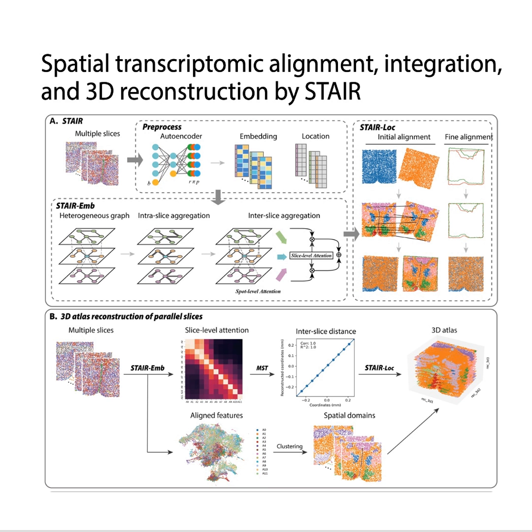And finally, there's the problem that plagues all of these kinds of reconstruction methods. The banana slicing problem. It's a great visual, isn't it? When you reconstruct a naturally curved structure like a brain or a developing organ from flat cross-sections, the current methods tend to straighten the overall structure out. So you get a straightened banana? Exactly. The reconstructed 3D atlas has this slight linearization. To fully recover that natural anatomical curve, STAIR would need some kind of external geometric prior, like MRI data, which it currently doesn't use.